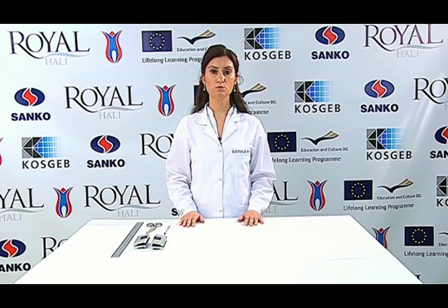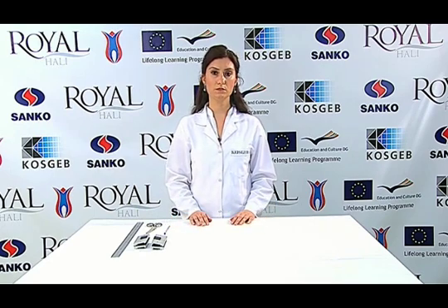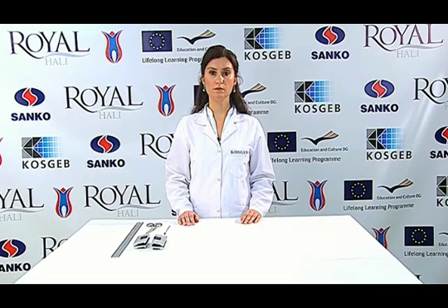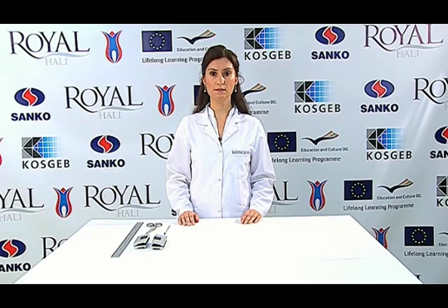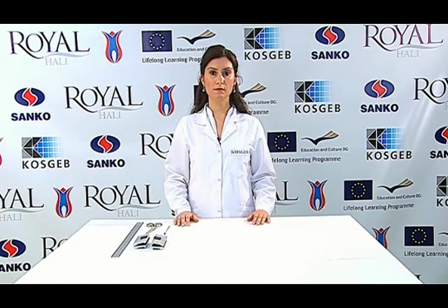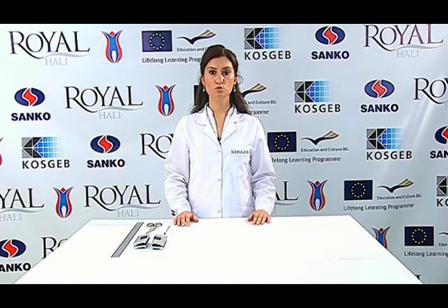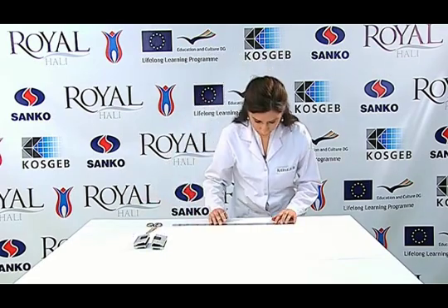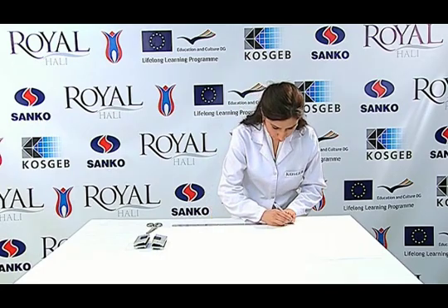The conditioned samples are spread on a flat surface and specimen preparation begins. The fabric specimen is not taken from places too close to the edges; specimens must be taken from no nearer the selvage than 150 millimeters. Specimens must not be taken from wrinkled places or places with folding traces. Taking five pieces of weft and five pieces of warp, two sets of the test sample are prepared. The sample size must be 100 millimeters by 400 millimeters.